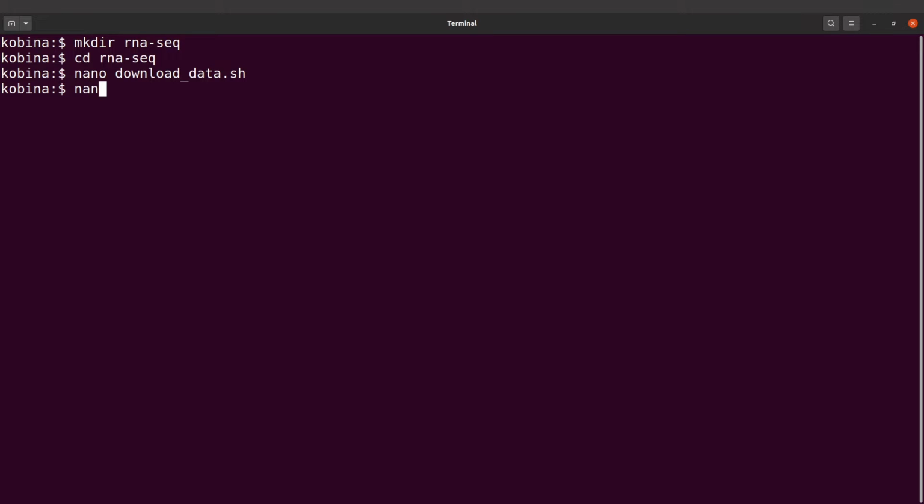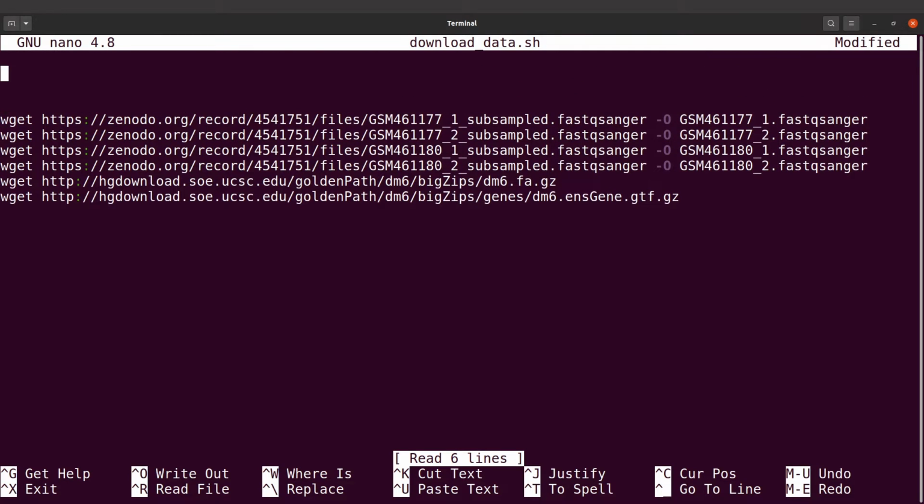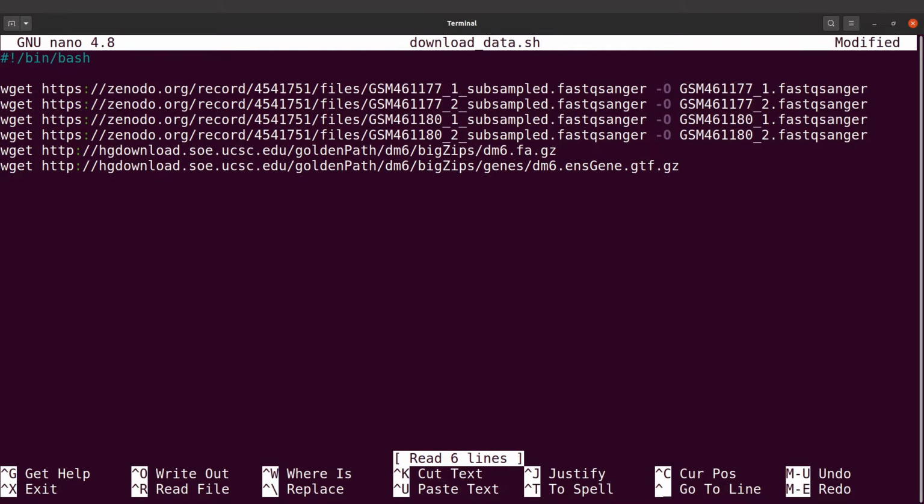I'll use this opportunity to show you a couple of things when it comes to writing scripts. So I'll go back again. I'll say nano. I'll edit the script here. Then the first line here, I'll say #!/bin/bash. This tells Linux that whenever we execute the script, bash should be used to run the commands here. That's basically what this means, the shebang line.